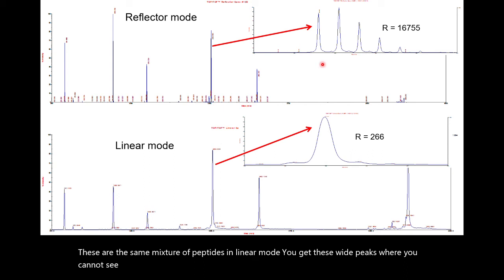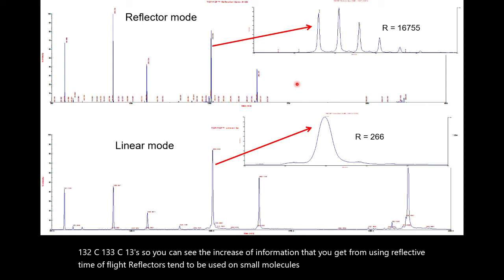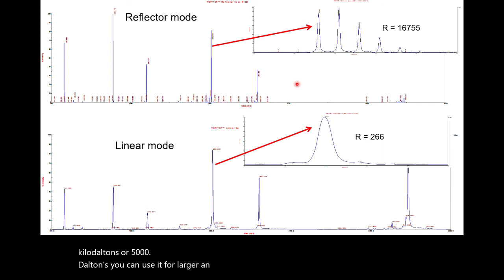And in reflector mode, you can see this is the population of C12, one C13, two C13, three C13s. So you can see the increase of information that you get from using reflector time of flight. Reflectors tend to be used on small molecules, less than say 5 kilodaltons or 5,000 daltons. You can use it for larger and larger molecules, but you need to tune the reflector for those larger molecules.